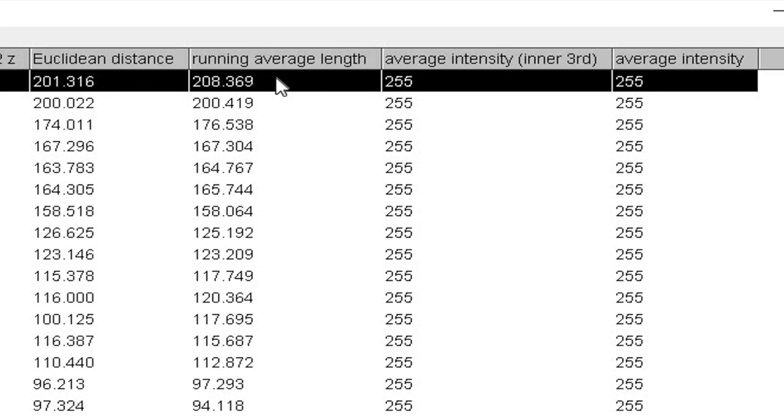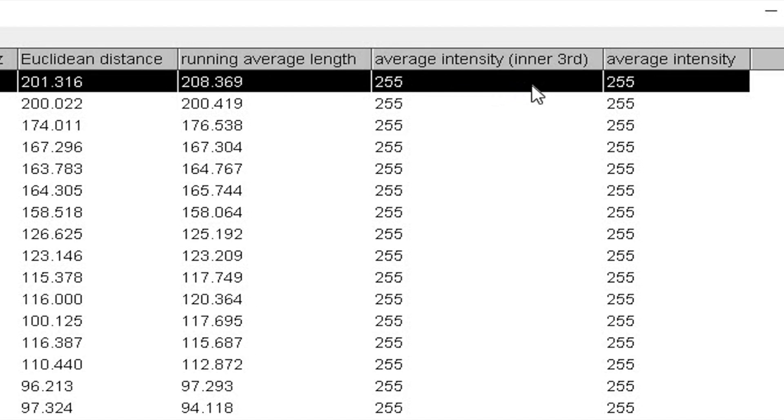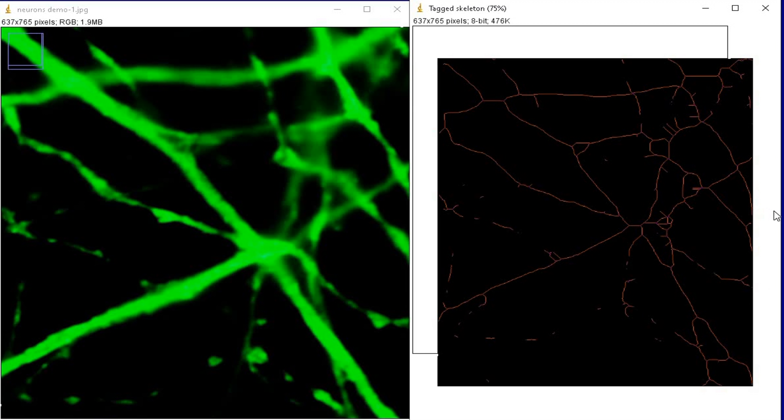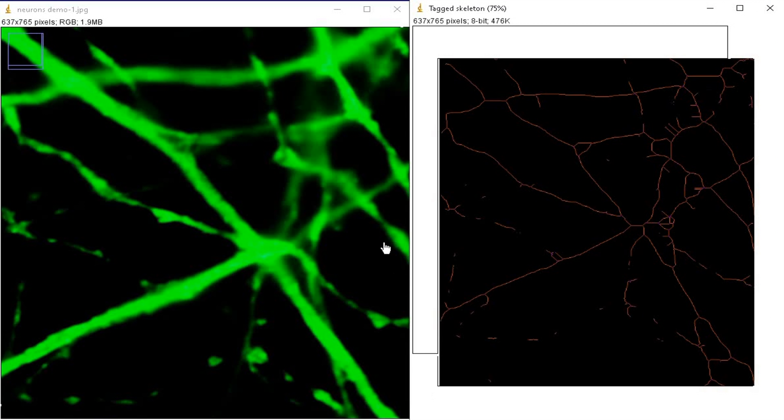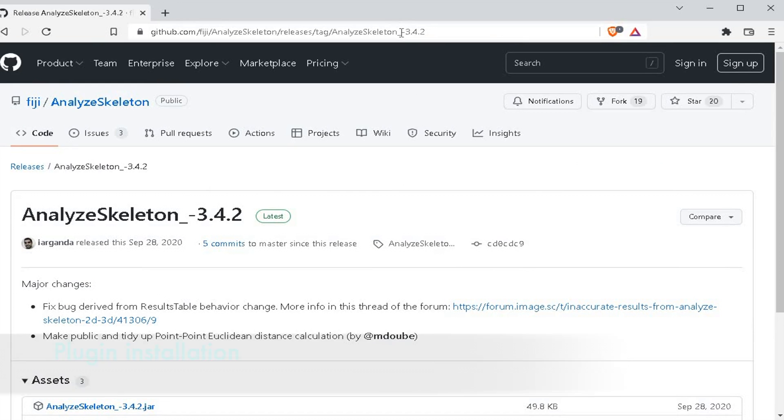In addition, the result also displays the running average length and the average intensity. Thus, we successfully analyzed the branching information of the neurons.